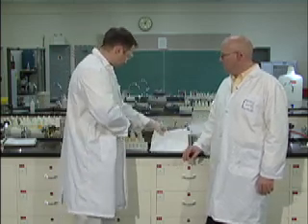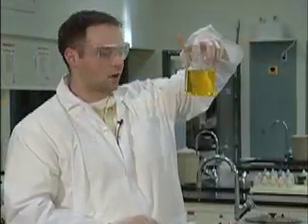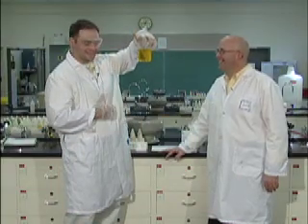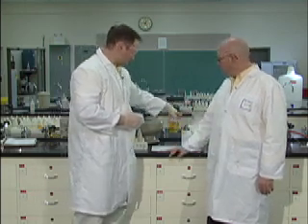But first of all, you need to make a preliminary observation for your unknown. Our preliminary observation for this unknown would be that it is a clear yellow solution. Looks like urine. Anyways, it's a clear yellow solution. Right off the bat, we're thinking, well, if it's a yellow solution, it quite possibly has some iron cations in it. If it were a blue solution, we'd think copper. If it was a green solution, we'd think iron and copper, because yellow and blue make green.